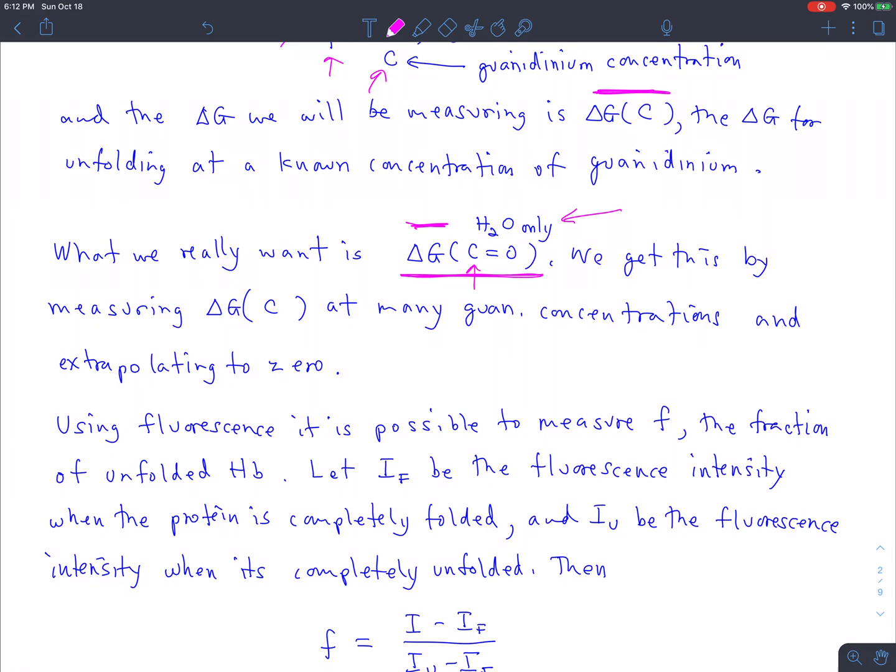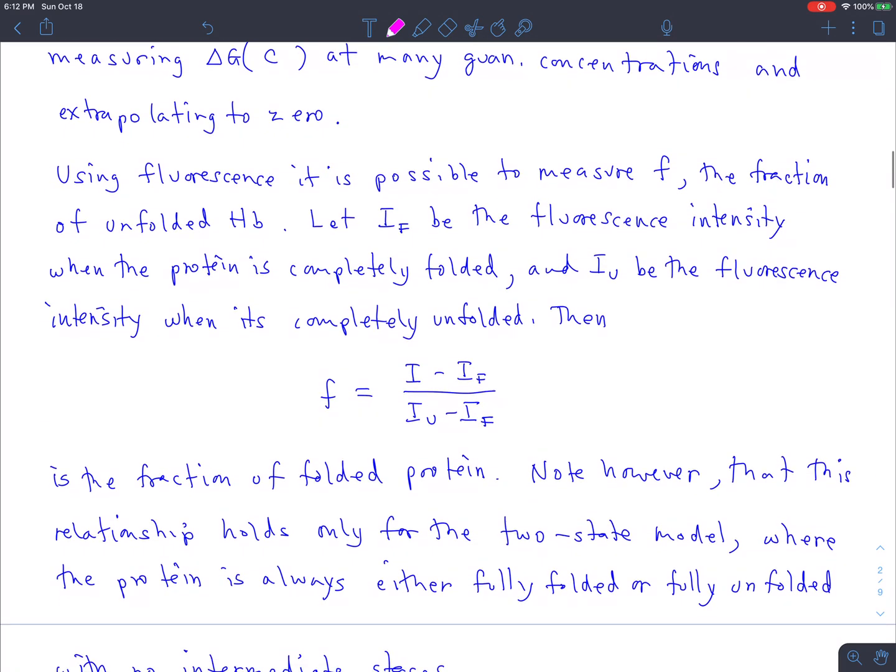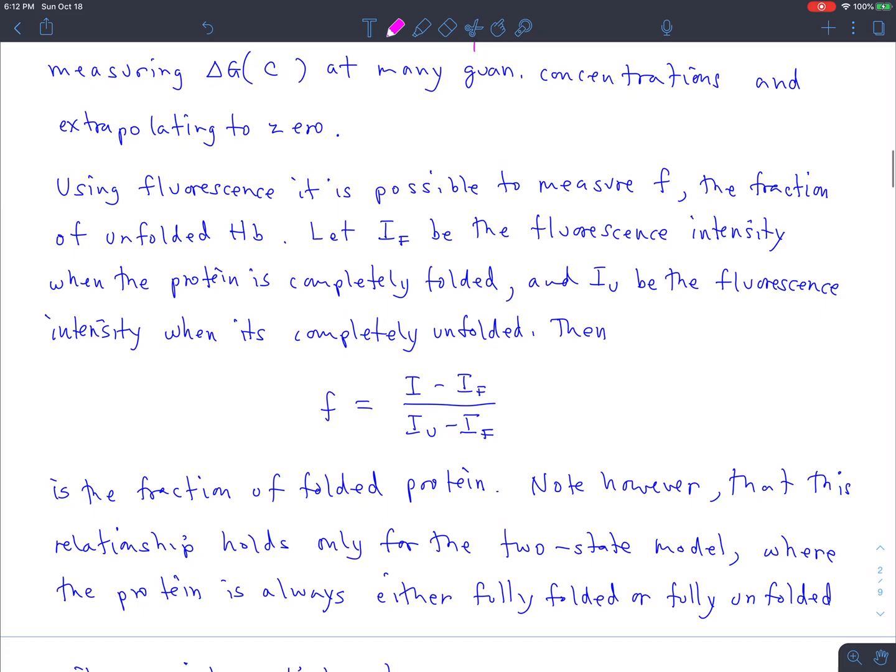So we want it when the concentration of guanidinium is 0. We're going to extrapolate to 0 in order to get that. All right, so how are we going to go about doing this? Well, we're going to use fluorescence to measure this fraction, and I'll talk a little bit below about how the fluorescence works, but basically the fluorescence intensity that you measure depends on how folded or unfolded the protein is.